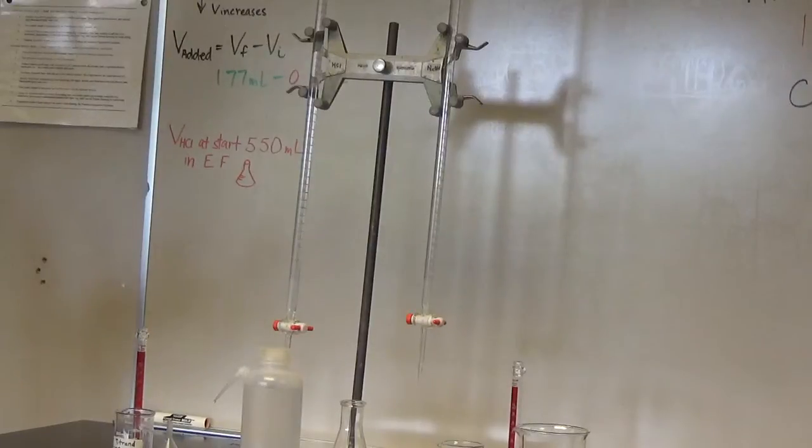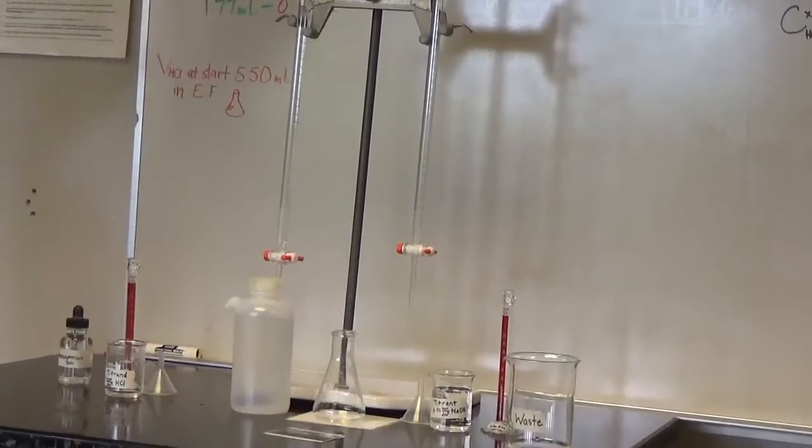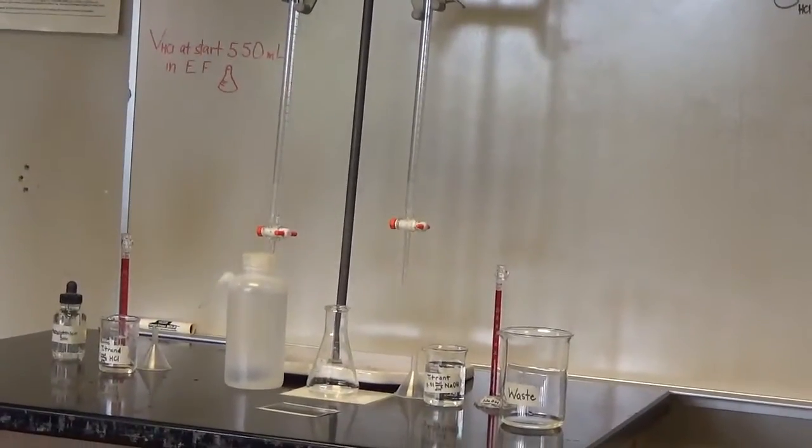Because it's an acid, thank you. It is an acid right now, so that part is good. I'm going to put that aside for now. Notice I've got everything listed here so I don't forget what anything is.